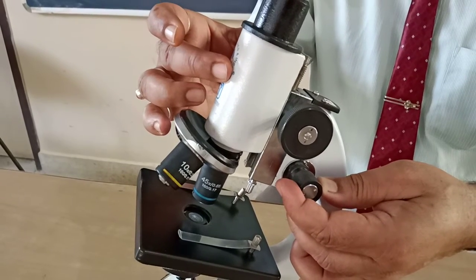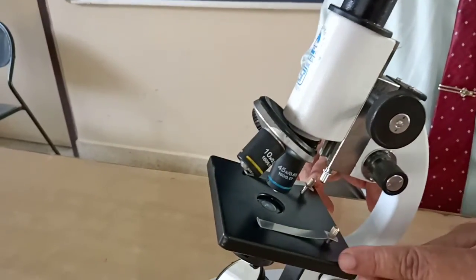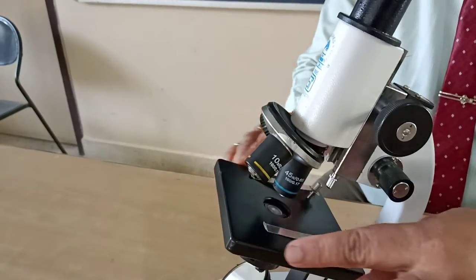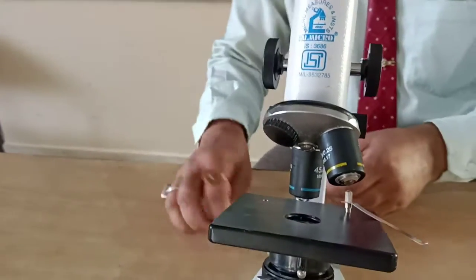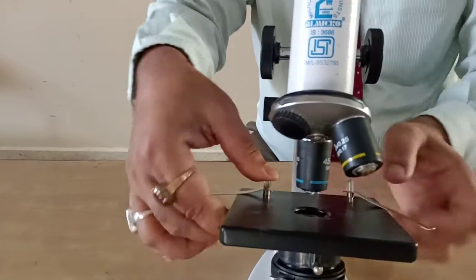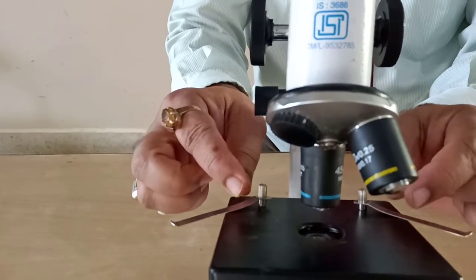First of all, we place the slide on this stage. This is the stage, for putting the slide, for placing the slide, and the stage has two clips called stage clips. These are stage clips. So there are two stage clips for holding the slide. Okay?